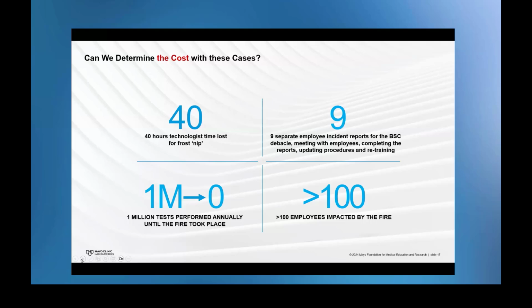The list goes on. All of this to say, we spend a lot of time and resources on incidents. Ergonomics is something I didn't mention at all today, but I can imagine you already know these injuries are among the worst because of the time away or restrictions that are put in place. This is why a root cause analysis helps us work backwards and ask, what if we had processes in place? And what could those processes be so these things don't occur to begin with?